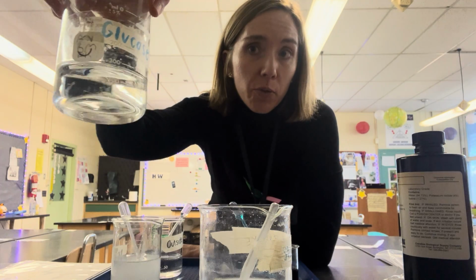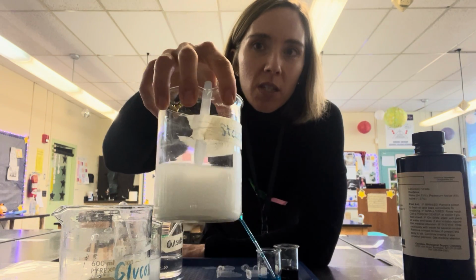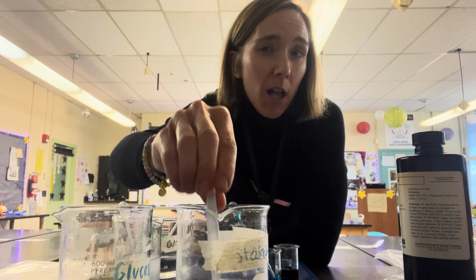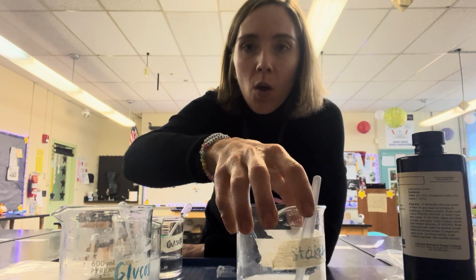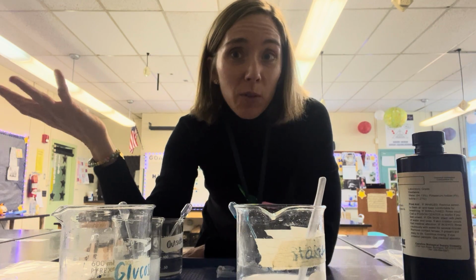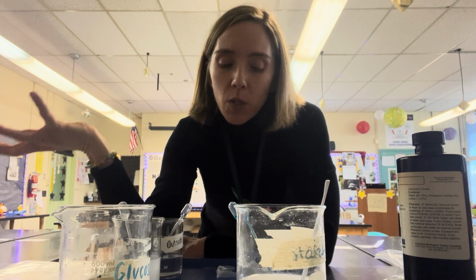Now, reminder, we're looking for two food molecules. We're looking for glucose, which I can't even tell is in here, and we're looking for starch, which is a little bit easier to see, but in smaller concentrations, it wouldn't make this milky white sort of color. We can't really detect it with our naked eye or rely on that to know if it's present inside the tube or outside. So what are we going to use?